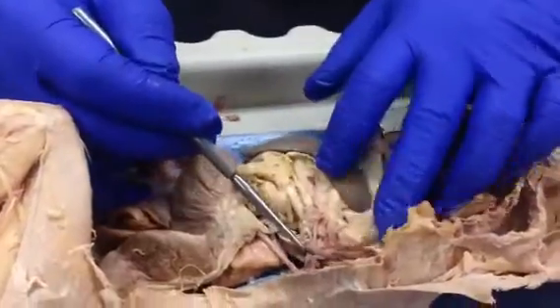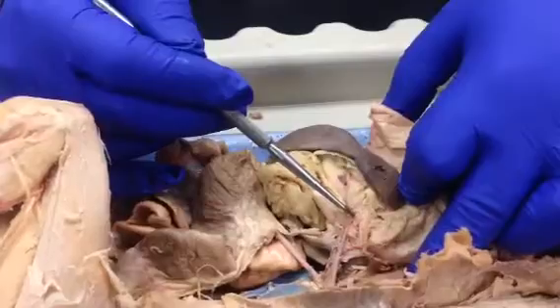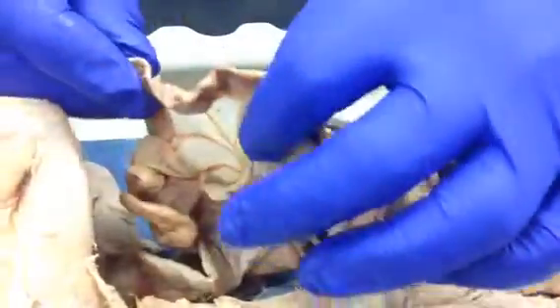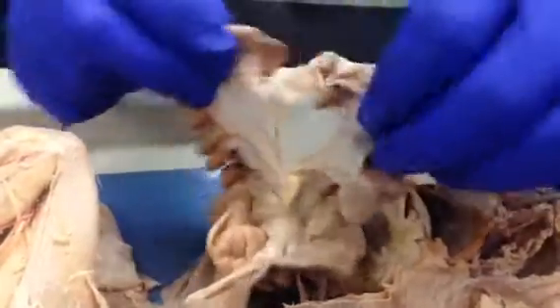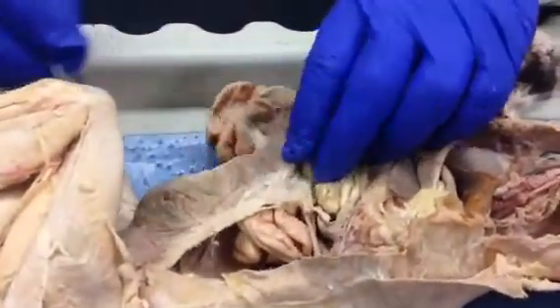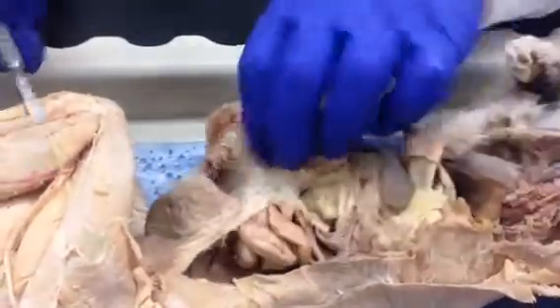Okay, we're not doing the branches in the cat of the celiac. I don't think those are listed for you to do. I hope not. Okay, I'm going to skip them. The superior mesenteric pretty much goes to the small intestine, and when you hold up the mesentery, every artery and vein you see there is intestinal artery and vein. Okay, that's kind of easy. Okay. Same thing is true down here. When this comes over, all these arteries and veins that are actually on the colon are called hemorrhoidal. I'm not sure that's on your list or not.